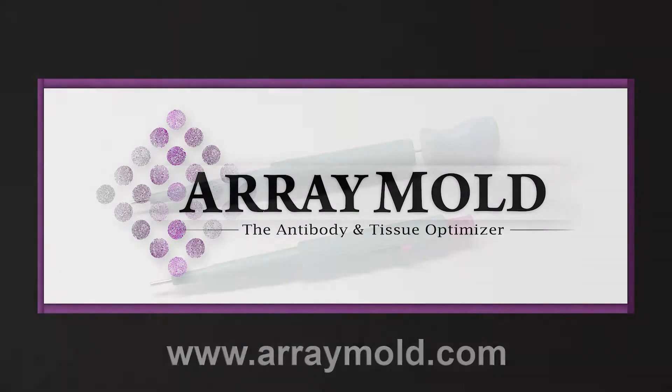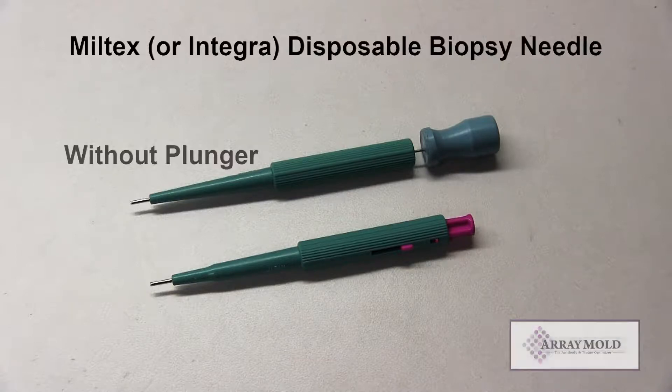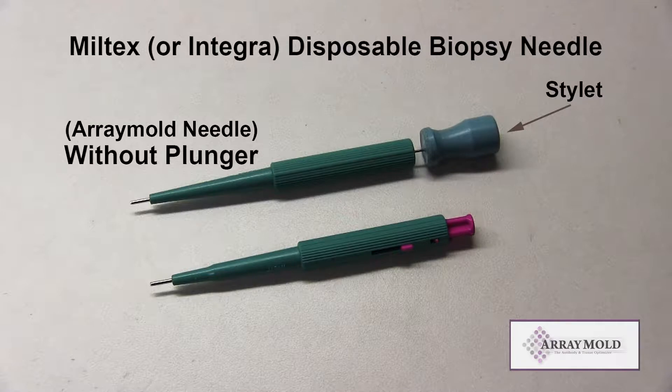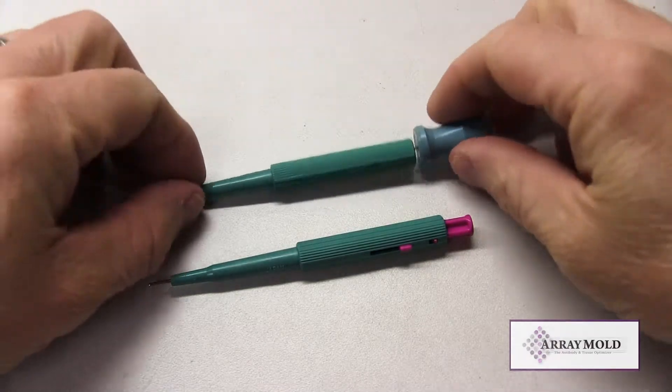Today we are going to discuss the two types of needles used with different silicone mold tissue microarray instruments currently on the market. The best needles to use are the Miltex or the Integra disposable biopsy needles. One of the needles has a plunger, the other does not.